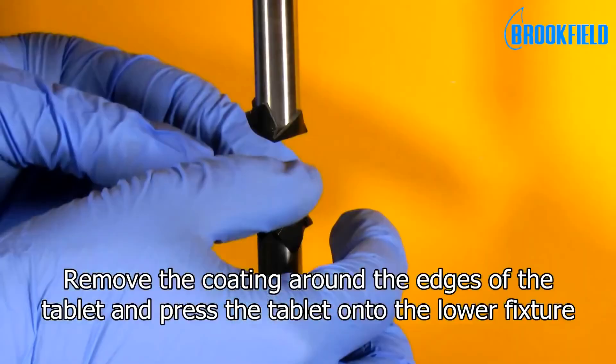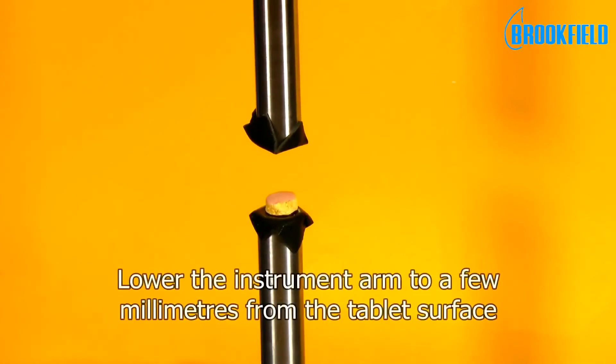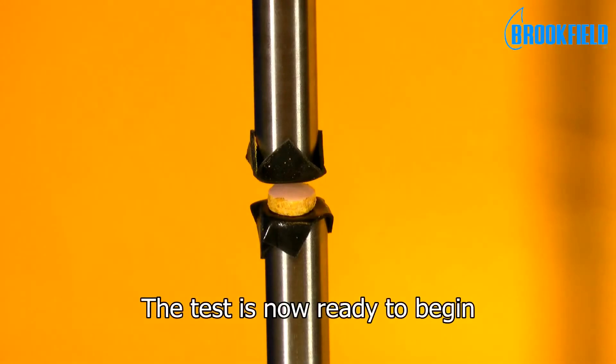Remove the coating around the edges of the tablet and press the tablet onto the lower fixture. Lower the instrument arm to a few millimeters from the tablet surface. The test is now ready to begin.